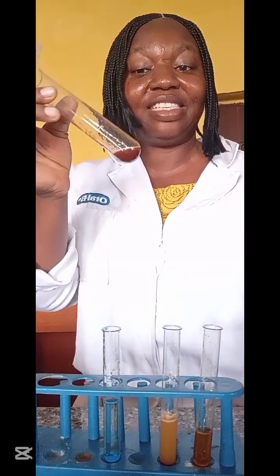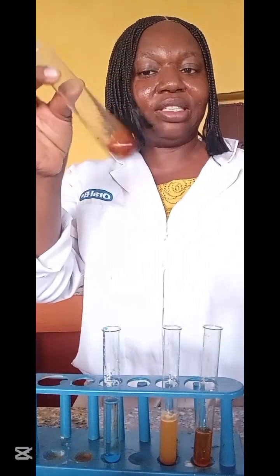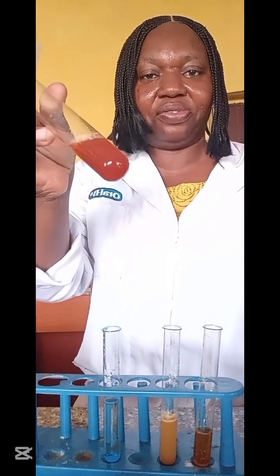This is a reddish brown gelatinous precipitate. See the gel. Reddish brown gelatinous precipitate, that's iron 3+. In excess, the precipitate does not dissolve. That's iron 3+.